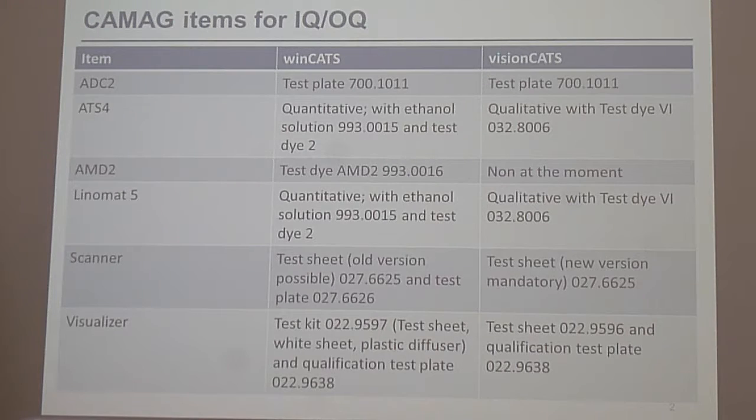So we also thought about giving it in a powder form, but then it would be phenacetin, and phenacetin is poisonous, and some countries would maybe work, but other countries would not work because they do not have a contract to use poisons. Sometimes it's illegal.